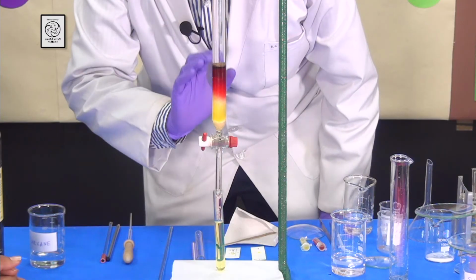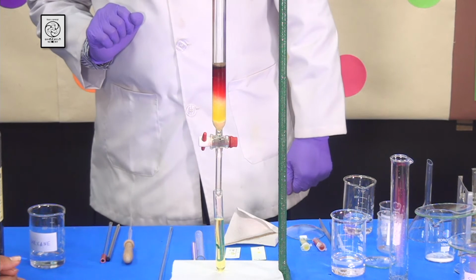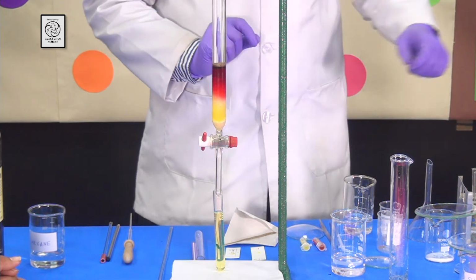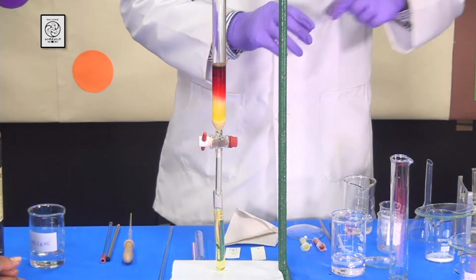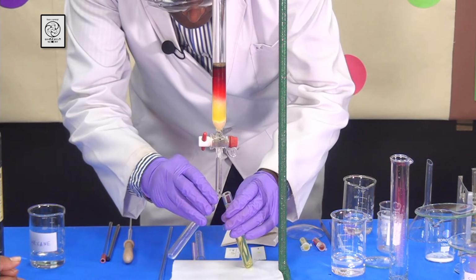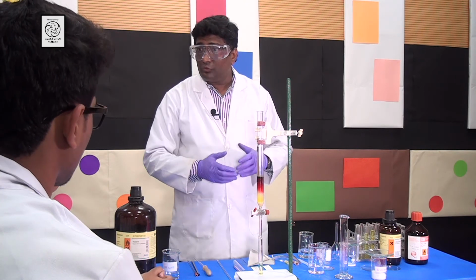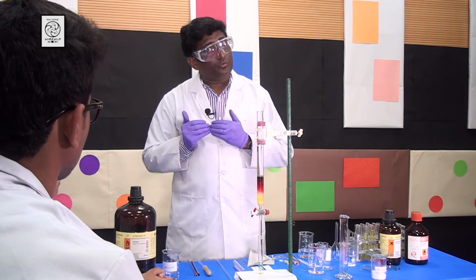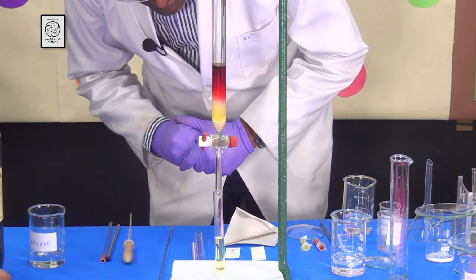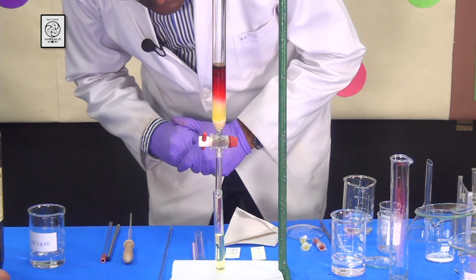As you can see, the mostly yellow compound is already eluted. Again, as my test tube is getting filled, I will take another test tube and collect my yellow compound. Students, also make sure that the speed is uniform. Don't go too fast, at the same time don't go too slow. Now, you can see that almost all of my yellow compound is eluted.